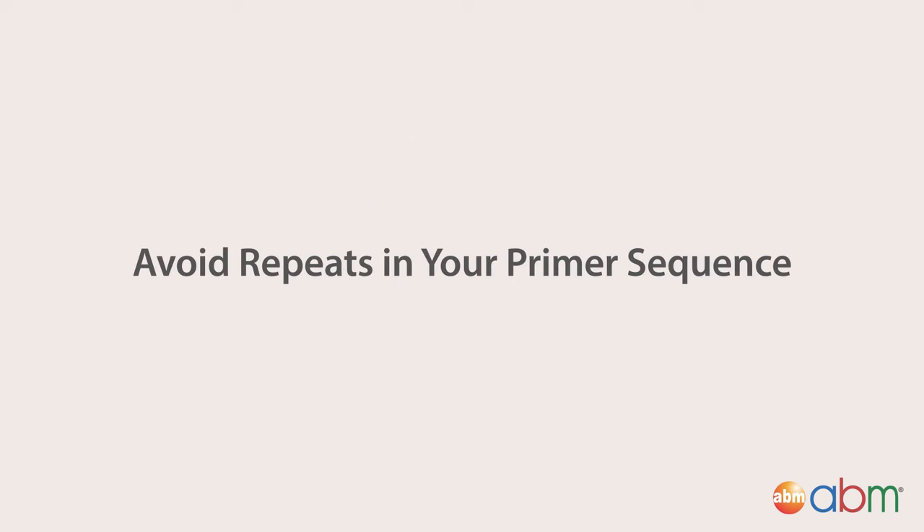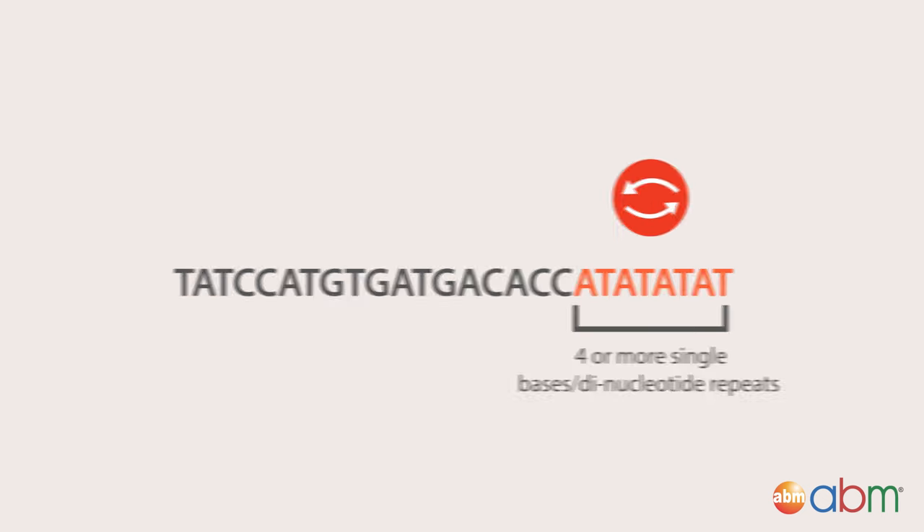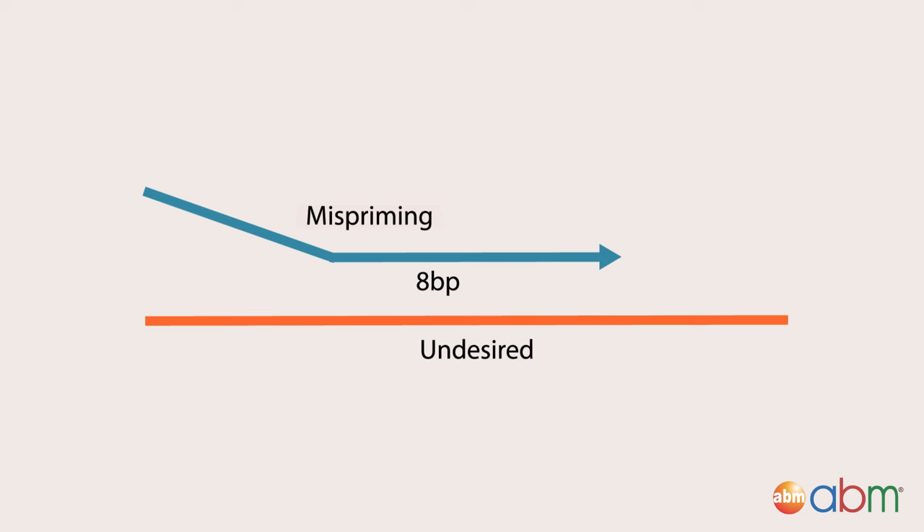Avoid repeats in your primer sequence. Another consideration is to avoid runs of 4 or more single bases or 4 or more dinucleotide repeats in the primer designs. Both situations can lead to mispriming, resulting in undesired products.